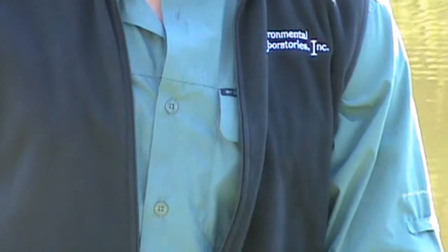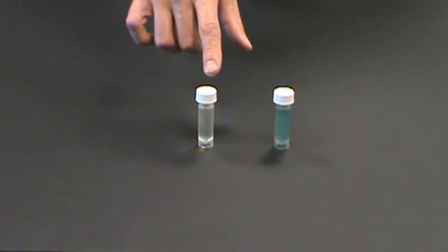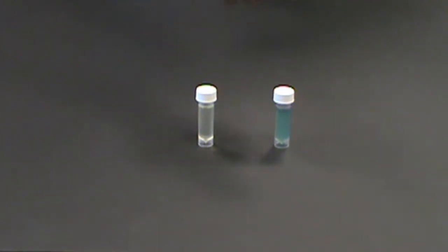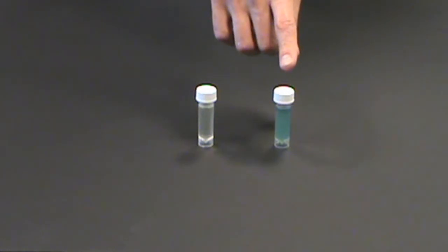The test could begin to yield results in as few as 36 hours, but could take as long as 72. After 72 hours, the colorimetric results will have become quite obvious. A yellow color indicates a negative test result, which is the absence of total coliform bacteria. A blue color indicates a positive test result, meaning there is most likely total coliform bacteria present in the water source.